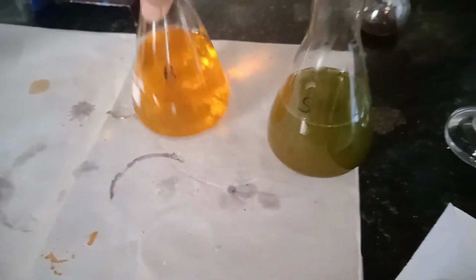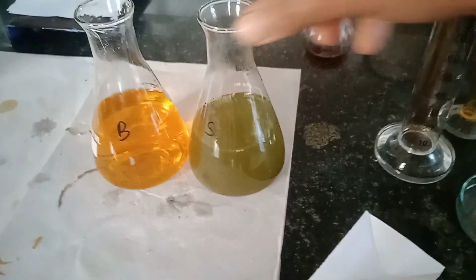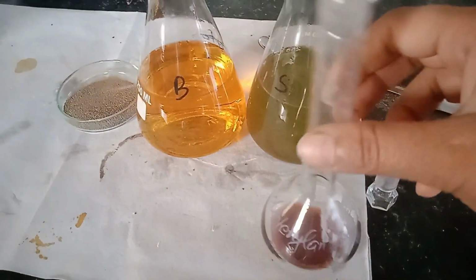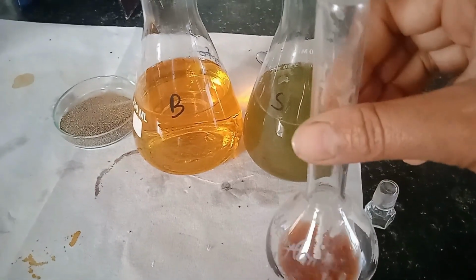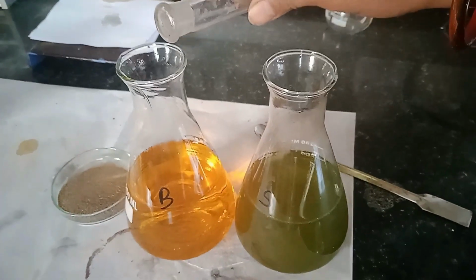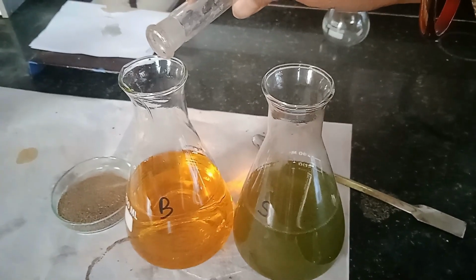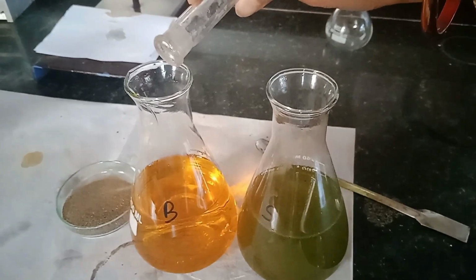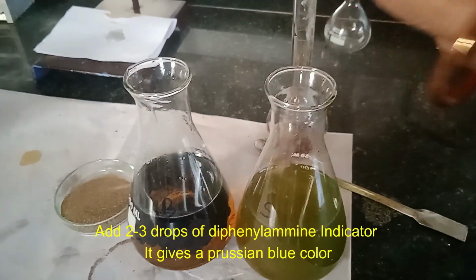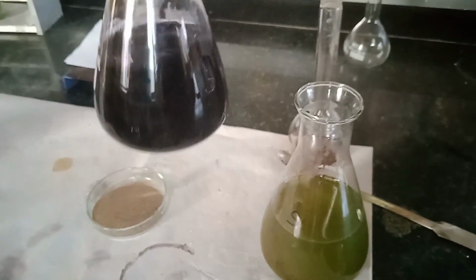So there is a difference in both blank and sample. Now we are going to titrate, but before titration we are going to add indicator. The indicator we are going to use is diphenylamine. Here I am going to add 2-3 drops of diphenylamine to the blank and you see the color change. It is Persian blue. Dark bluish color is there.